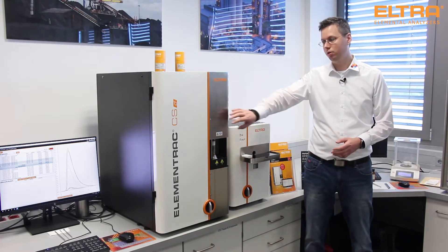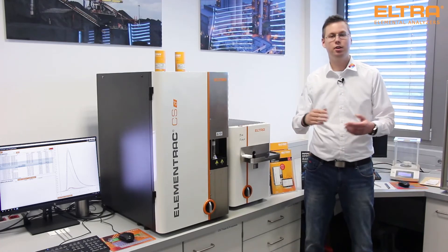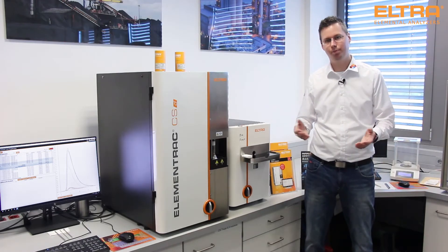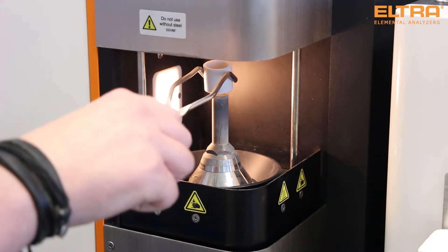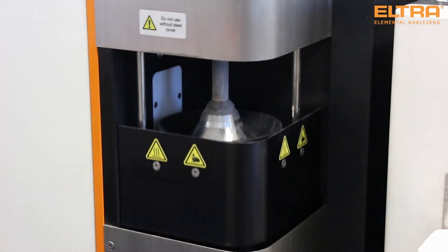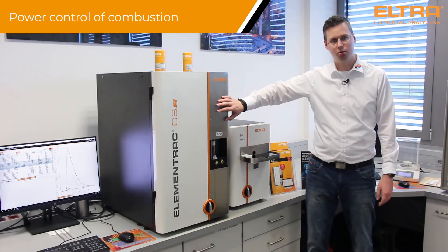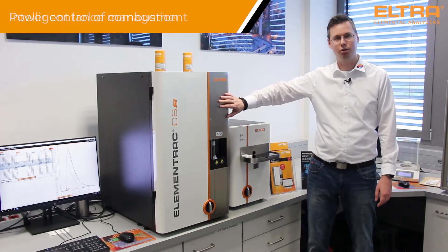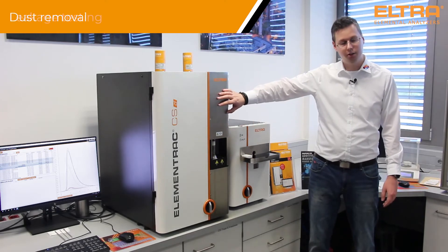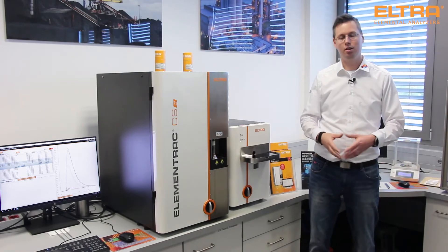The induction furnace provides temperatures above 2,000 degrees Celsius, so that even refractory metals melt and can combust in an oxygen stream. Thanks to the closed furnace system, even the lowest concentrations — around 1 ppm — can be detected easily. Comfort features like power control over induction, intelligent lance management, dust removal, and leakage testing help with daily analysis and make it really easy.